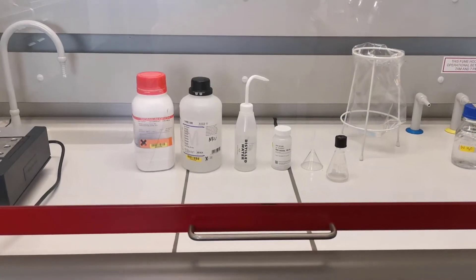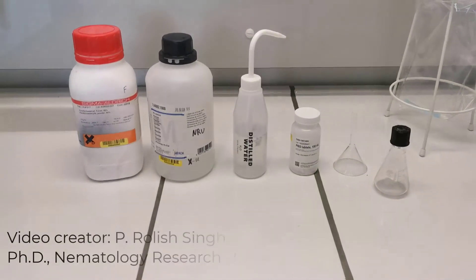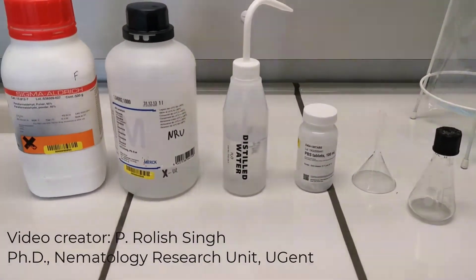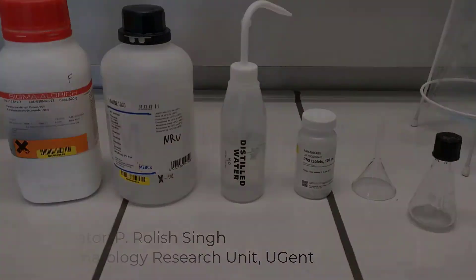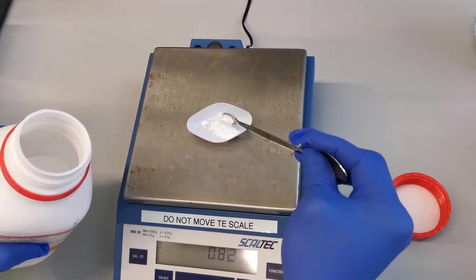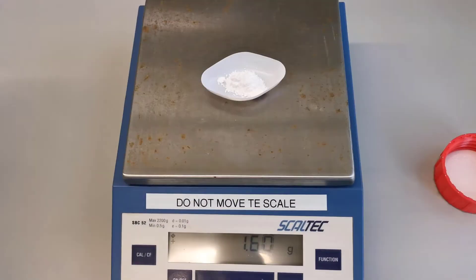As the main ingredient paraformaldehyde or PFA is a toxic chemical which can cause health hazards, working under a fume hood is highly recommended. Depending on the amount of the fixative you want to prepare, you can calculate the amounts of all the requirements.